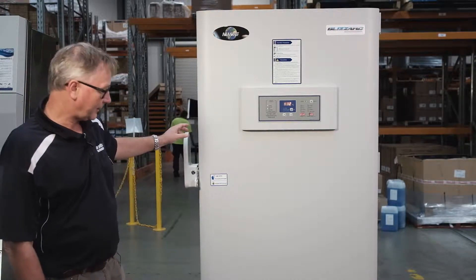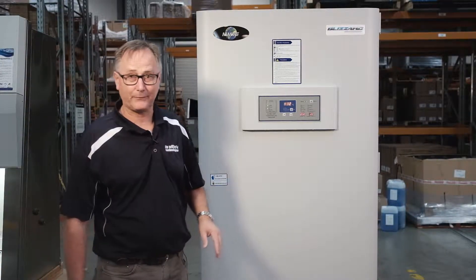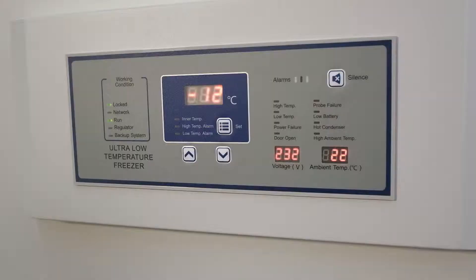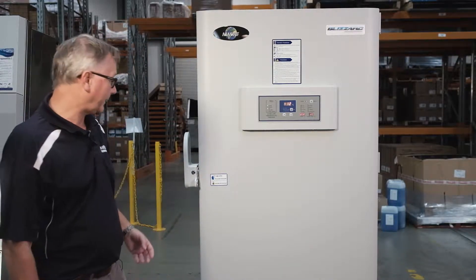This freezer is the 728 litre capacity, and we'll talk about some of the features. It has a new state-of-the-art controller, and it has some features for downloading and monitoring remotely.